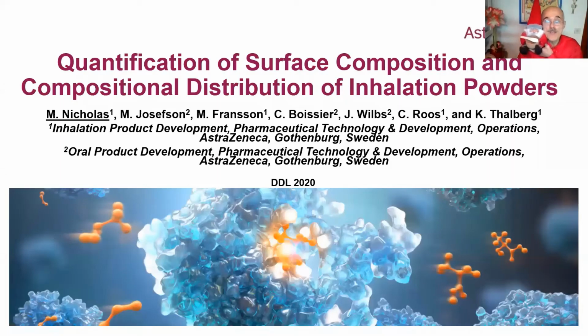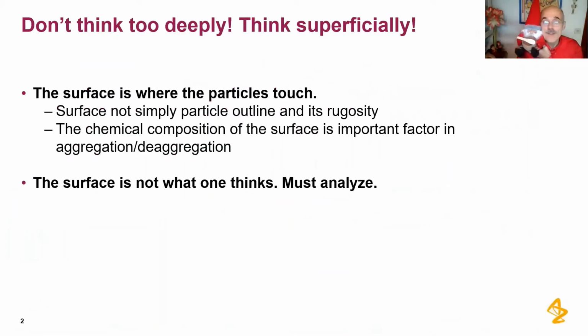In this presentation, Yul Tompton and I are going to convince you that the surface composition of inhalation powders is important to know and that it is in fact knowable. Don't think too deeply, think superficially. The surface is where the particles touch.